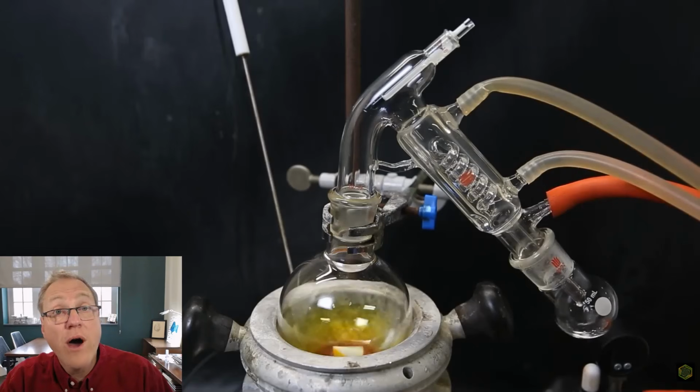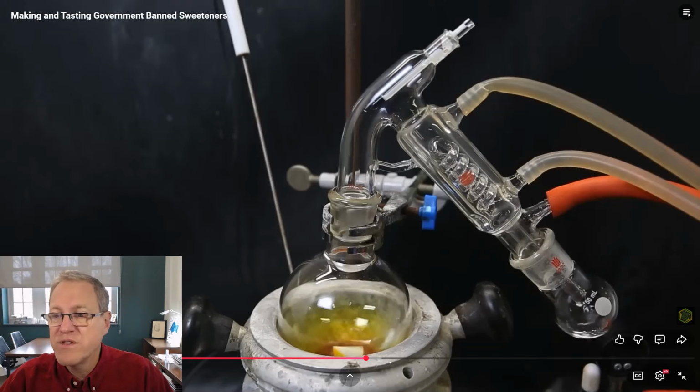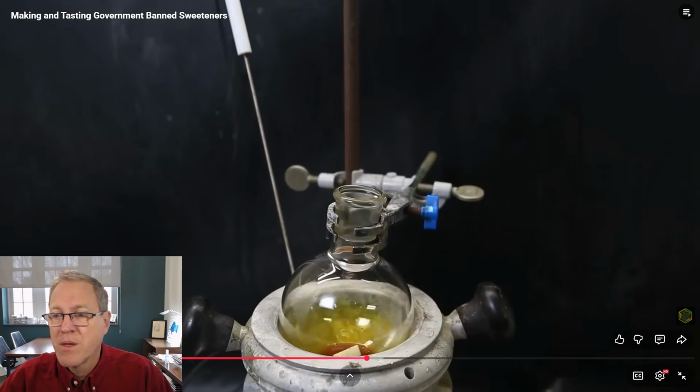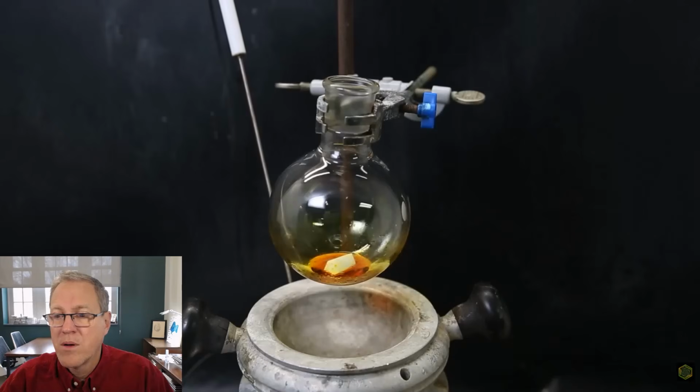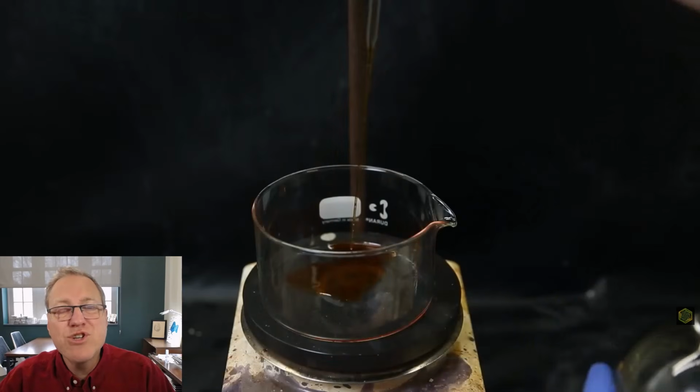That should leave his product, as well as possible impurities that could be in there. This isn't purified at this point, but he removes all the solvent. When it's done, I am left with the product as an orange-red liquid. To solidify it, I pipette it all into a dish. So he knows his product should be a solid. If it's pure enough, it should be a solid.